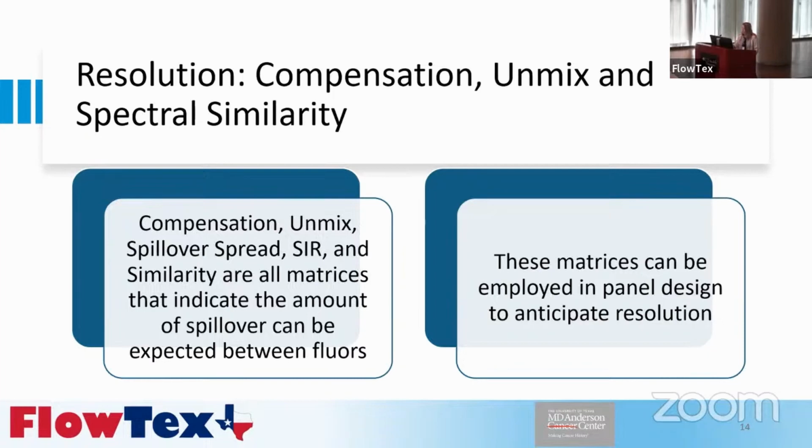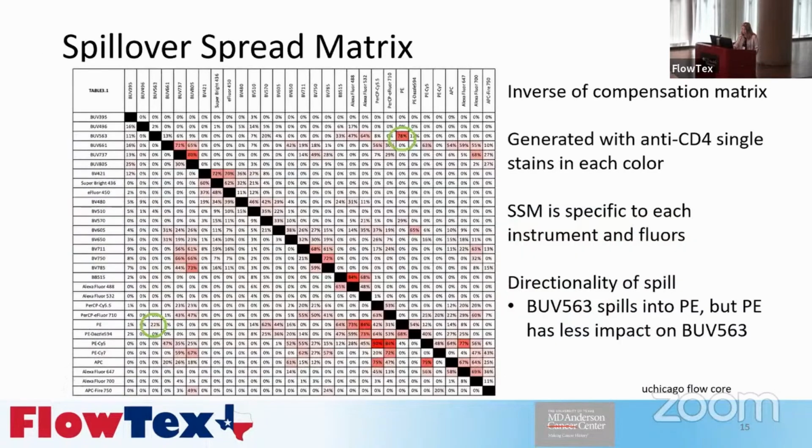I'm just going to tell you that your panel design should think about what the compensation or unmix or spectral similarity or spillover spread matrices are going to look like with the panel that you use. So we're going to walk through an example.